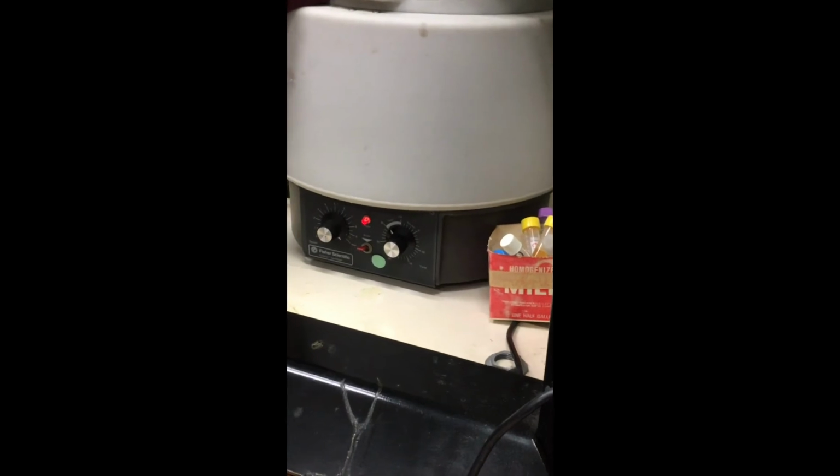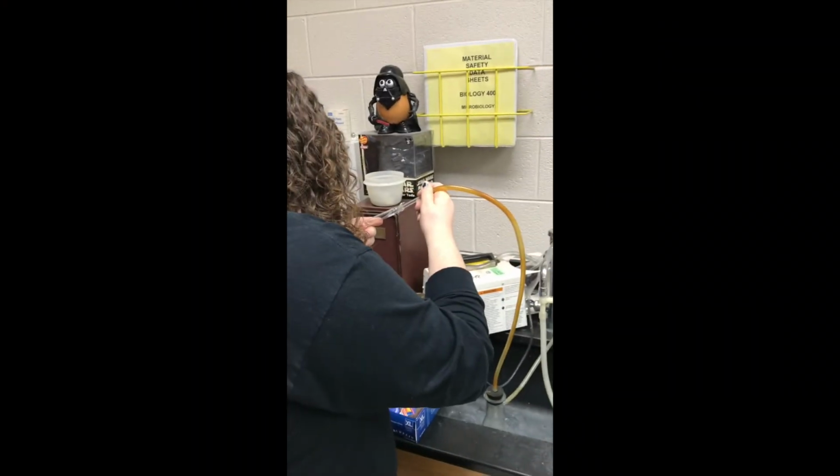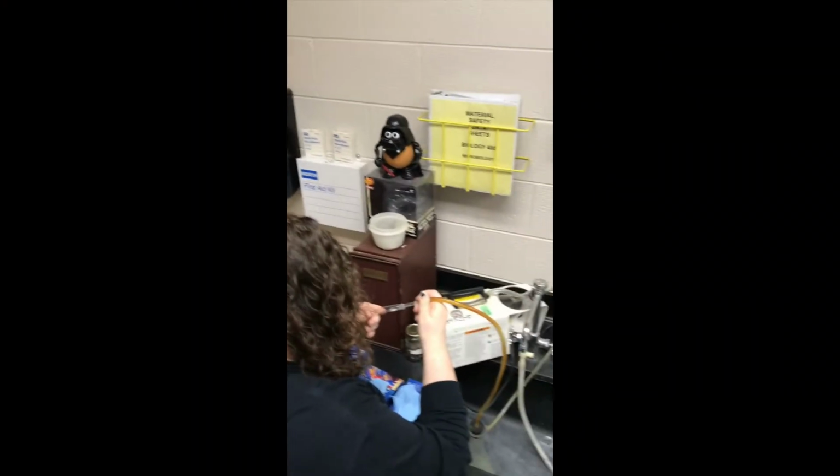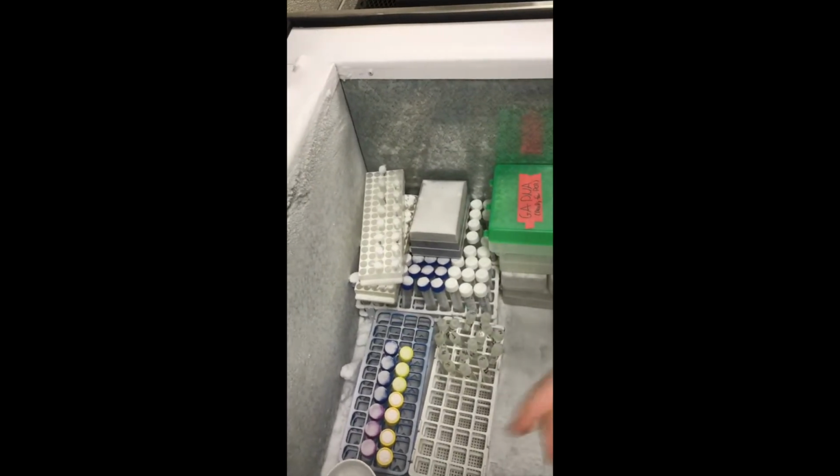As growth stabilized, we centrifuged the tubes to form a pellet of algae to isolate the cells for the lipid assay. We discarded the tap medium from the tubes to then isolate the pellets. Next, we froze the tubes at negative 80 degrees Celsius until every sample's growth had stabilized.